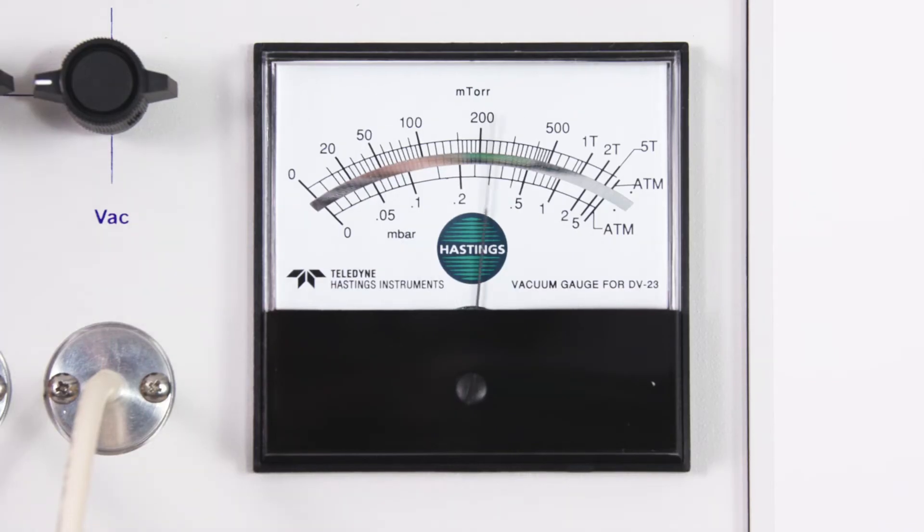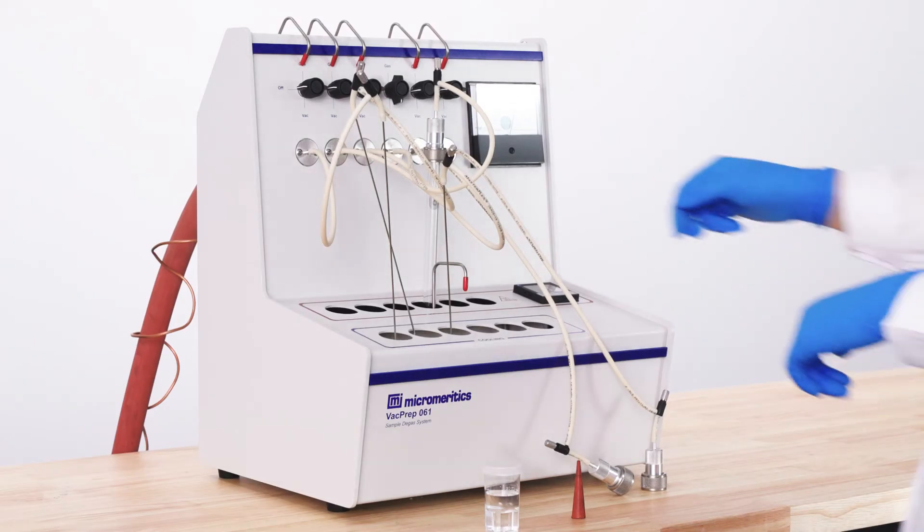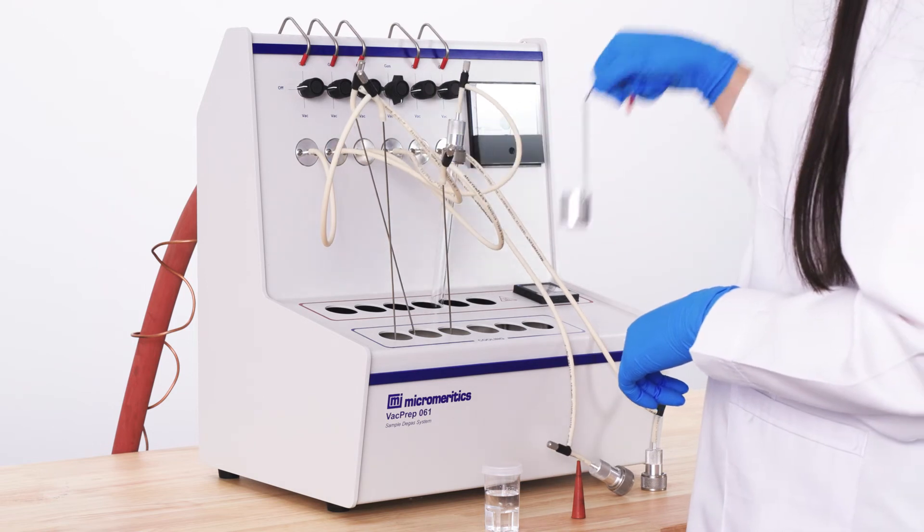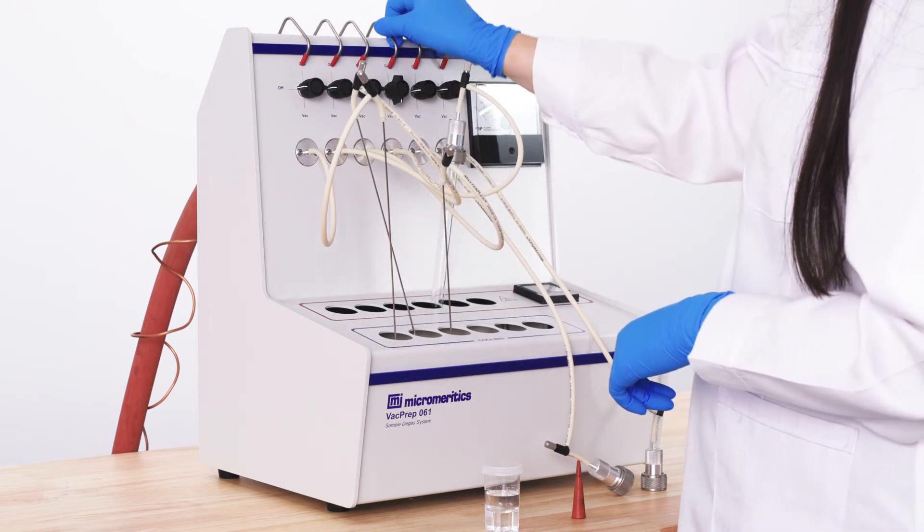As a vacuum is pulled, the gauge should read the decrease in pressure. When the degas process is complete, move the sample to the cooling station and allow to cool.